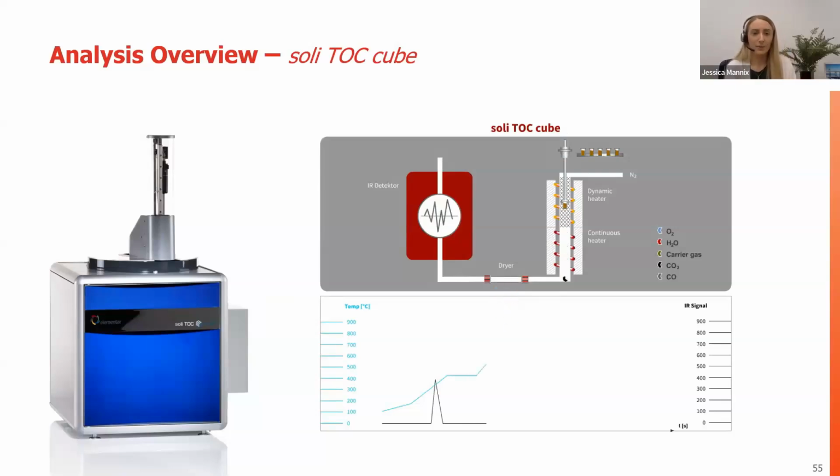If you have any halogens in your samples, that can be filled with brass wool, silver wool, whatever you can get your hands on there. Silver wool is typically a little bit better, a little bit more expensive. So we'll see brass wool for the most part.